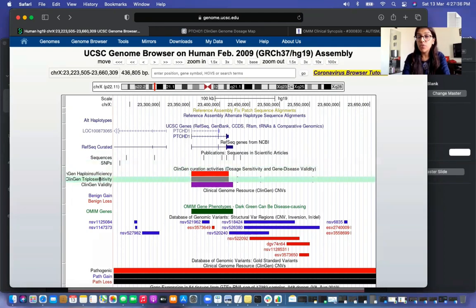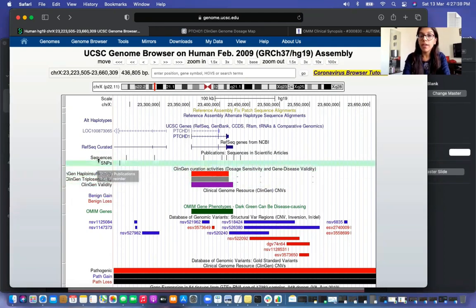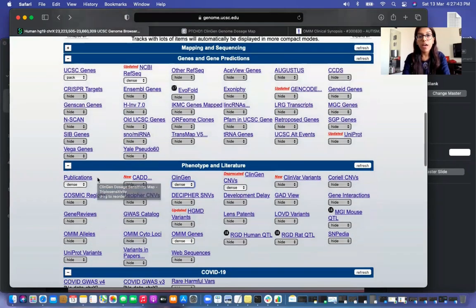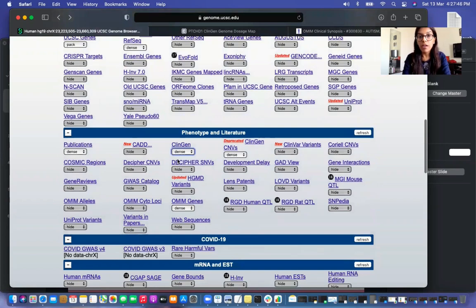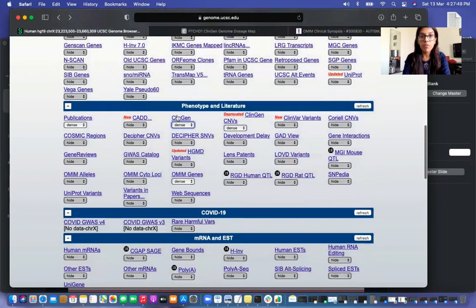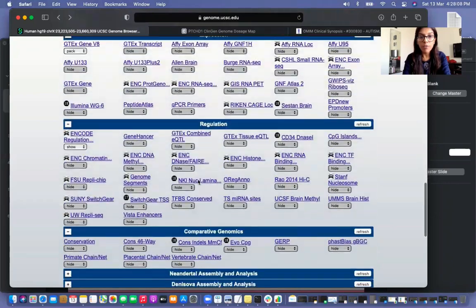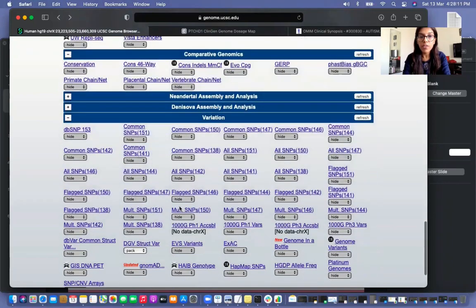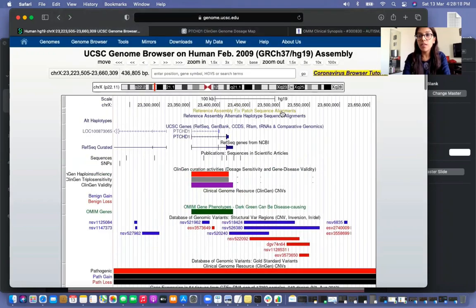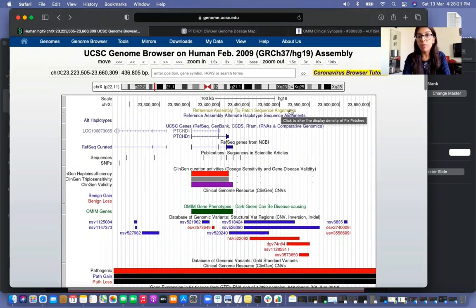Some tabs might not be visible when you try it yourself because they are hidden by default in the UCSC web browser. If you scroll down, you will reach a tab called phenotype and literature. From there, click on the dense options for ClinGen and ClinGen CNVs instead of the default hide setting, and also click on dense for OMIM. Additionally, select the DGV structural variant tab to be visible, as these are needed to evaluate our CNV.